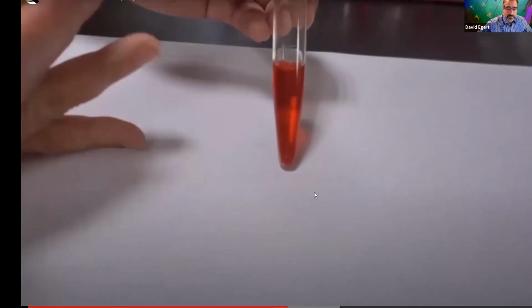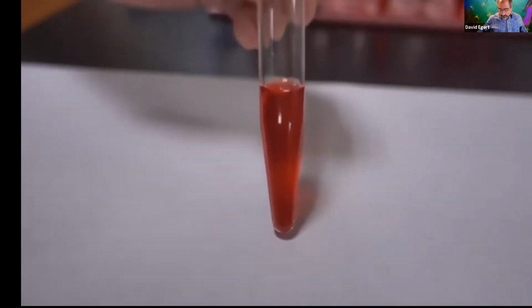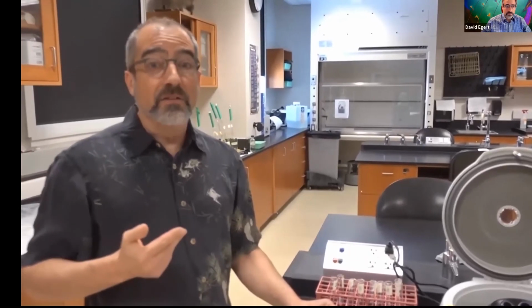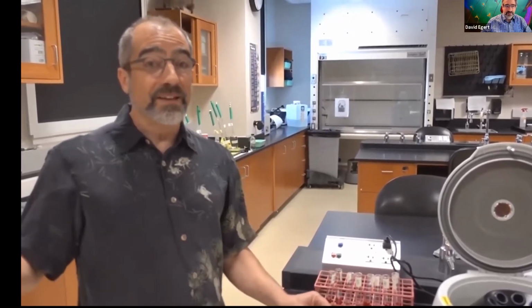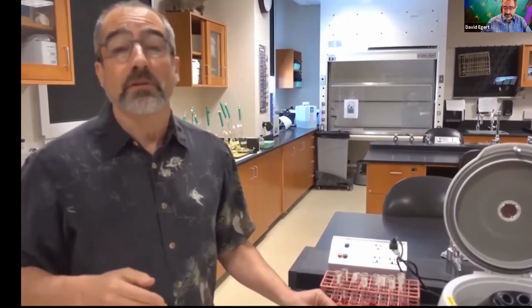We can see the supernatant is bright red, and if you look for a pellet, it's really not a pellet, which is telling us that all the cells are popped. All we got are little shreds of membrane in there. And in fact, a little clue, when we look at this under the microscope and you're trying to see what happened, imagine you were in a room full of balloons and then every balloon got popped.